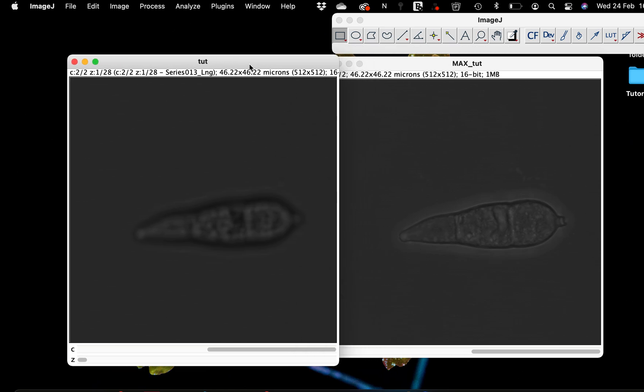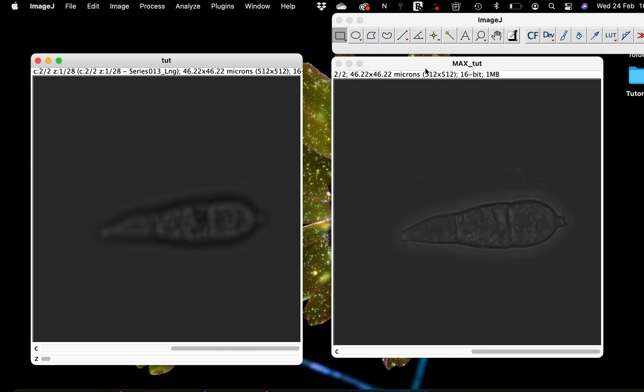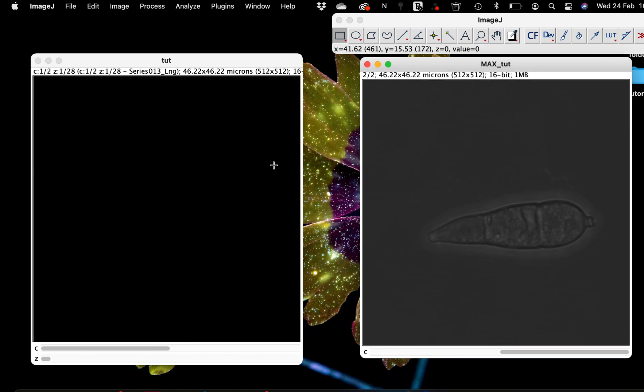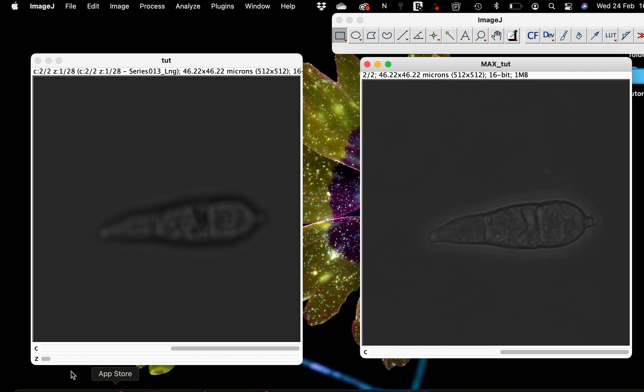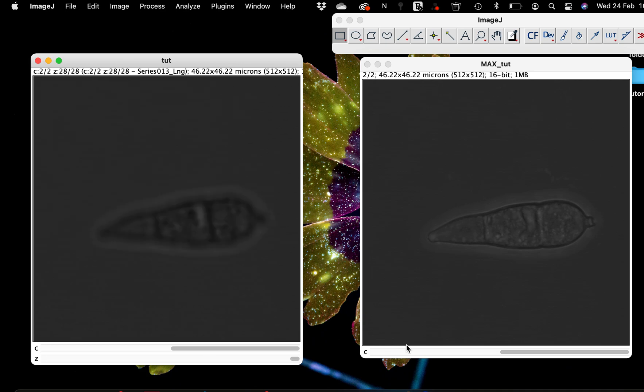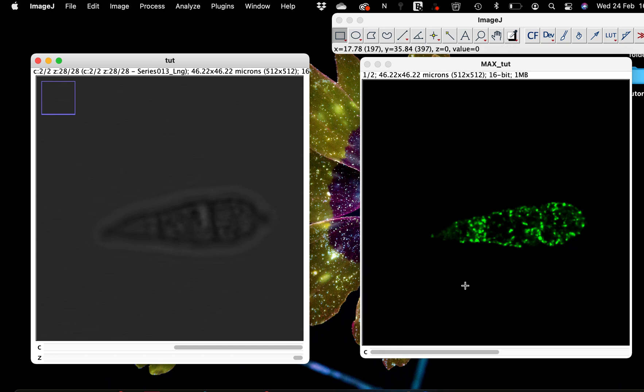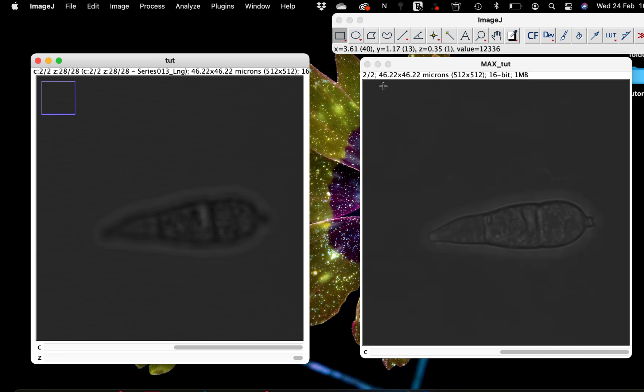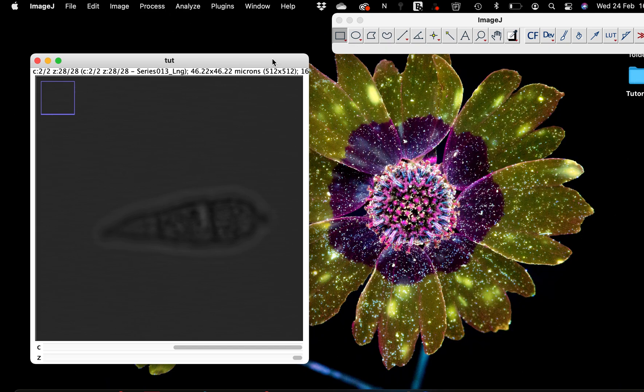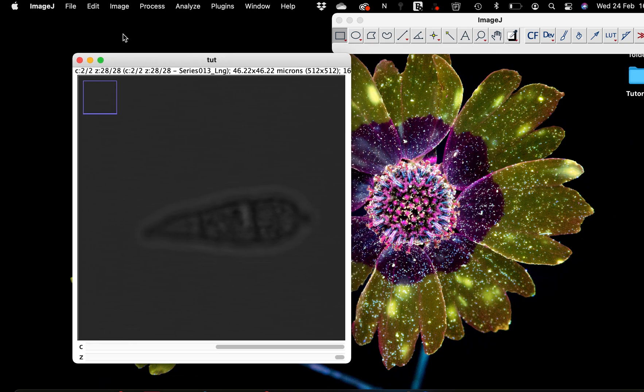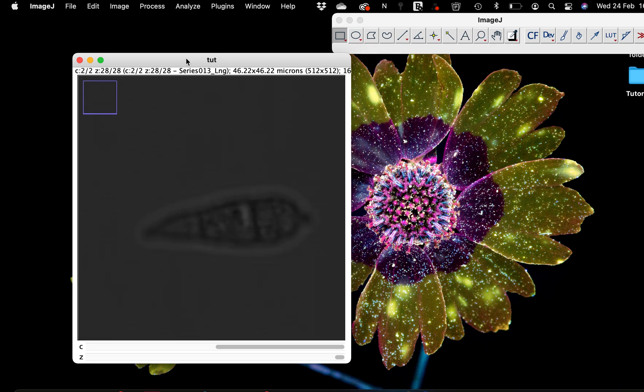Without any further ado, let's get started. So here I have this image that is a Z-stack image and I would like to make a maximum projection of this image like I've done here. So I'm going to close these. In one of my tutorials I've shown how to do this, but because of the purpose of macro I'm going to show you. First thing you need to do is go to plugins.